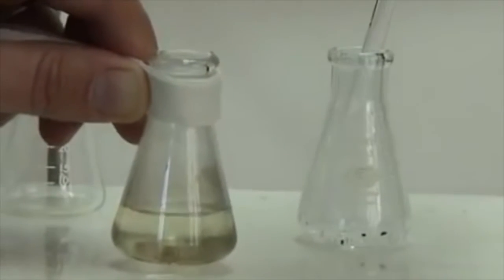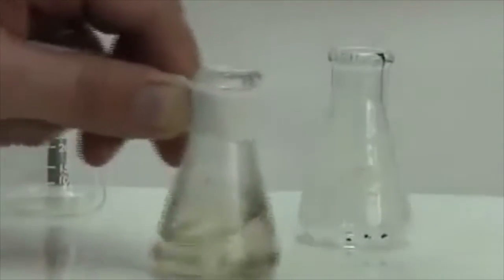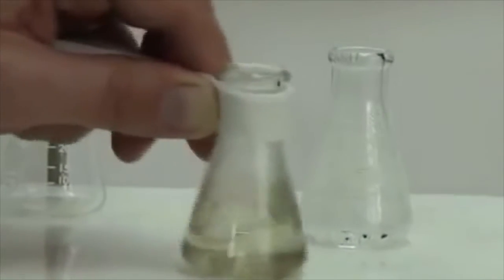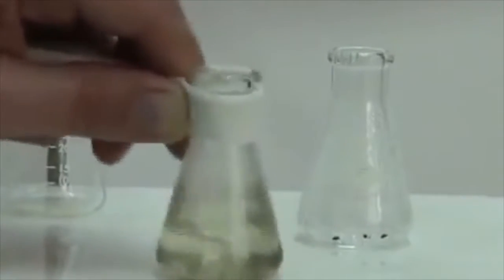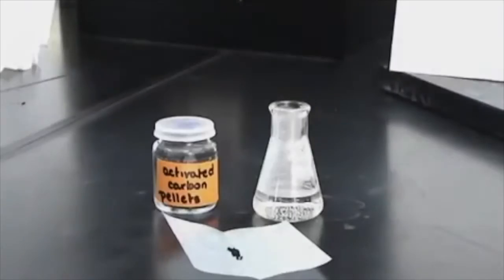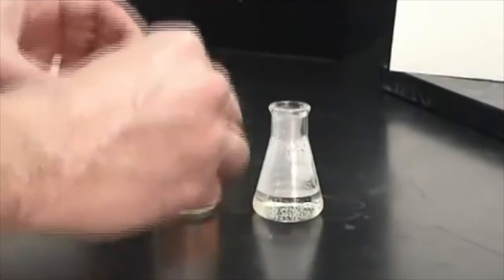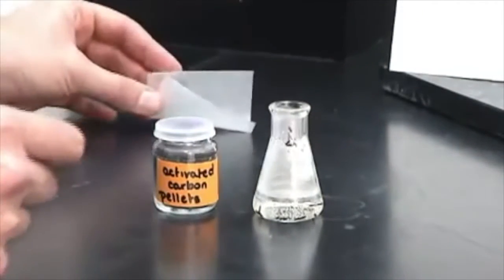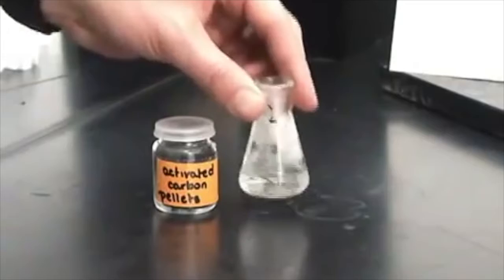So we continue adding the solvent. As you can see, the solution has a slightly yellow cast. We can remove this color by treating the solution with activated carbon, then swirl and warm it again on a hot plate. So just like I said, we're adding activated carbon just to remove the yellow color in our solution.